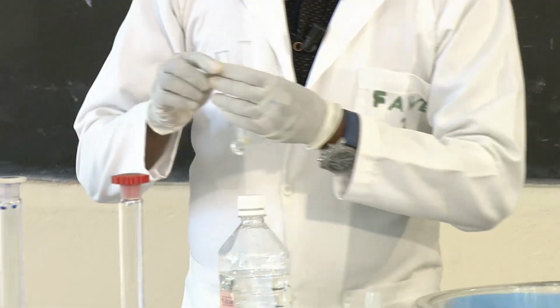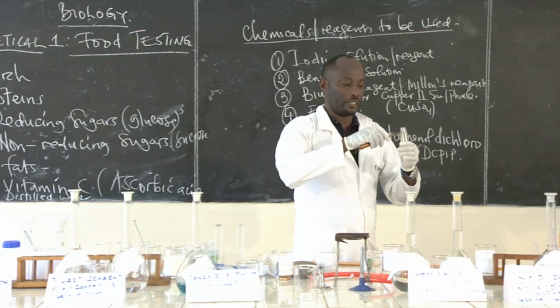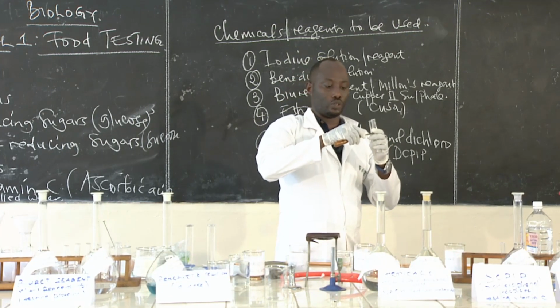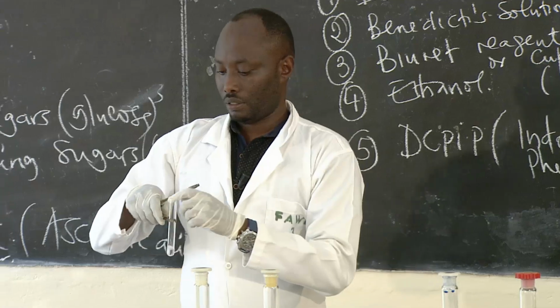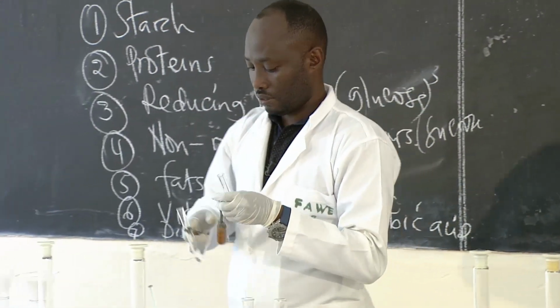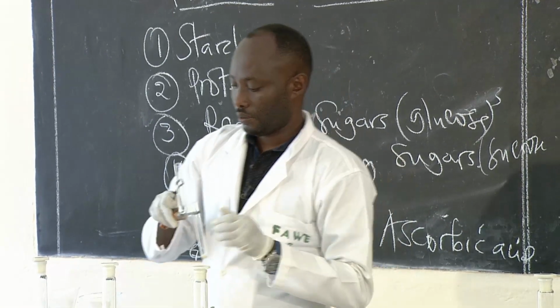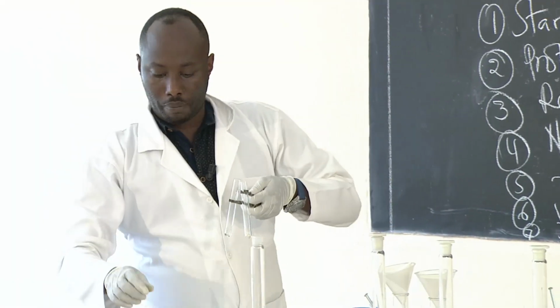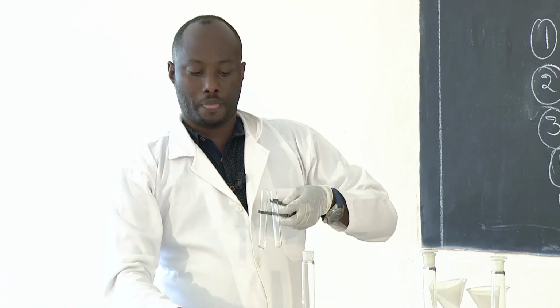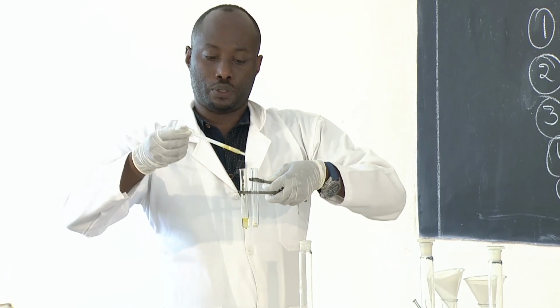Does the sweet potato contain starch? Now, I will make it, and you observe it and tell me if this one is acting as a control experiment. I'm going to put the same amount of iodine solution now in the two test tubes. I add the same drops.